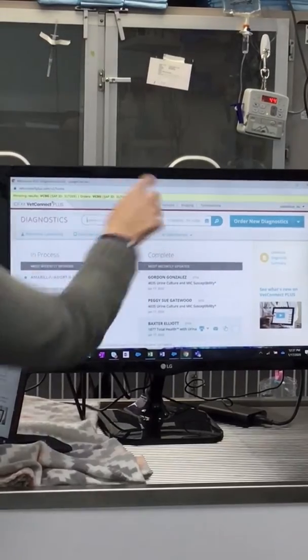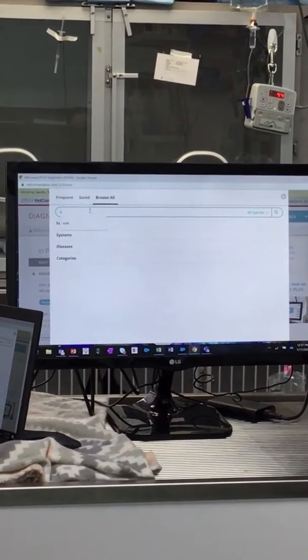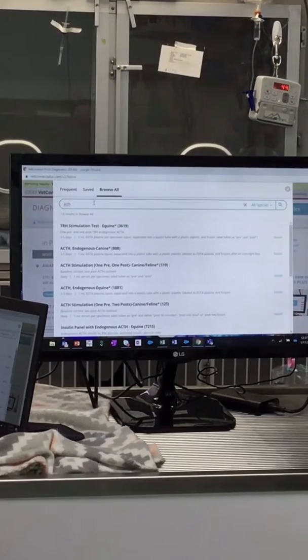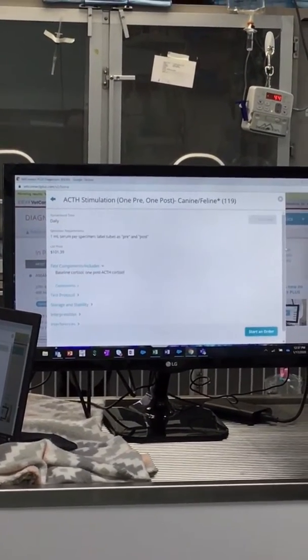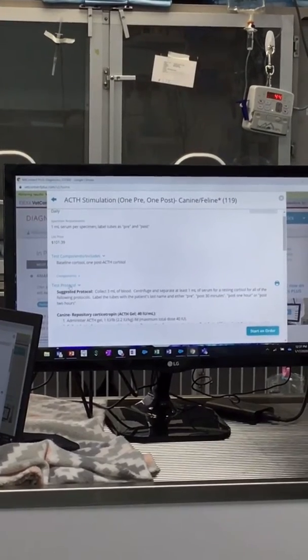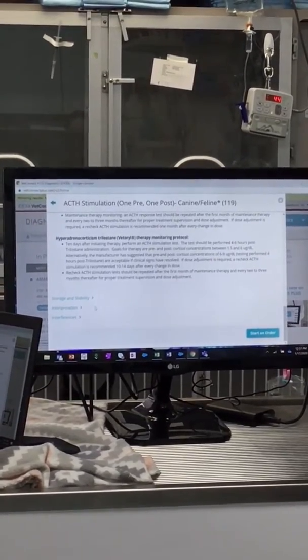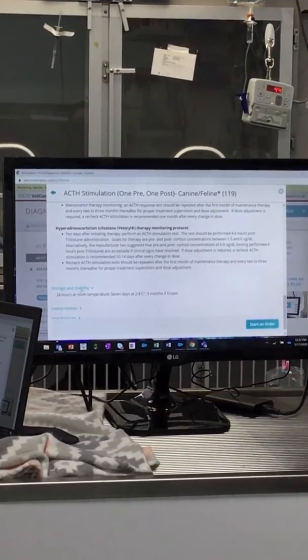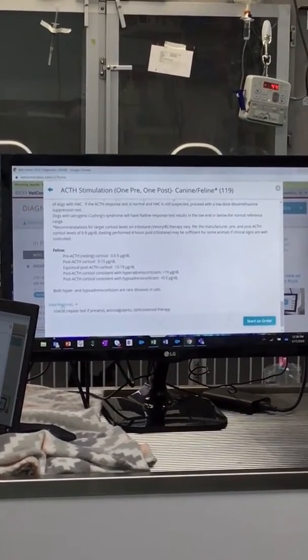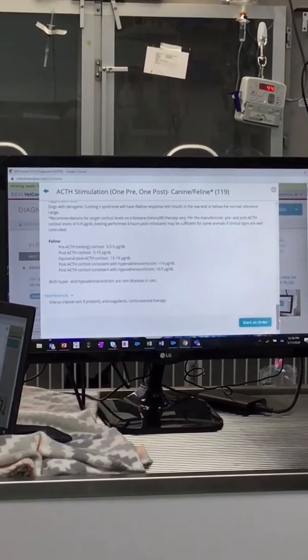Okay, so what I'm going to do is go up here to the directory of services. So I'm just typing in ACTH because I'm sure you have books to tell you the different stimulants you do that, right? So what is super cool is you can actually go into this one, and there's a test protocol. So right there it's going to tell you what's recommended. You can print it out if you want, or you could just read as needed. And again, nice thing, it's going to tell you how it can be stored, so if you're not going to send it out right then. Interpretations, of course, will be with the results, but also your interferences, which is nice. So if hemolysis is going to affect that test, or if it's icteric, it lets you know that ahead of time.